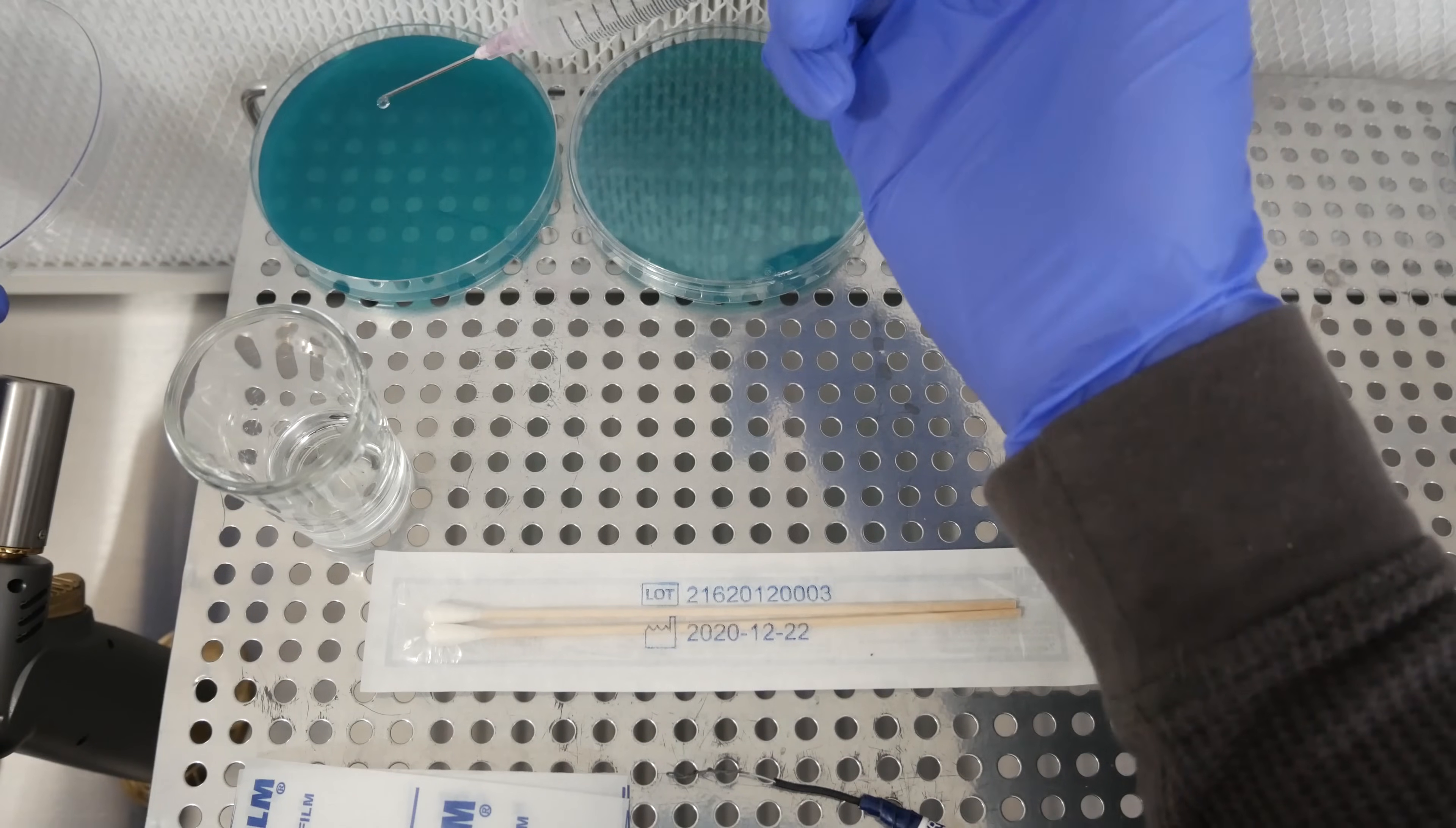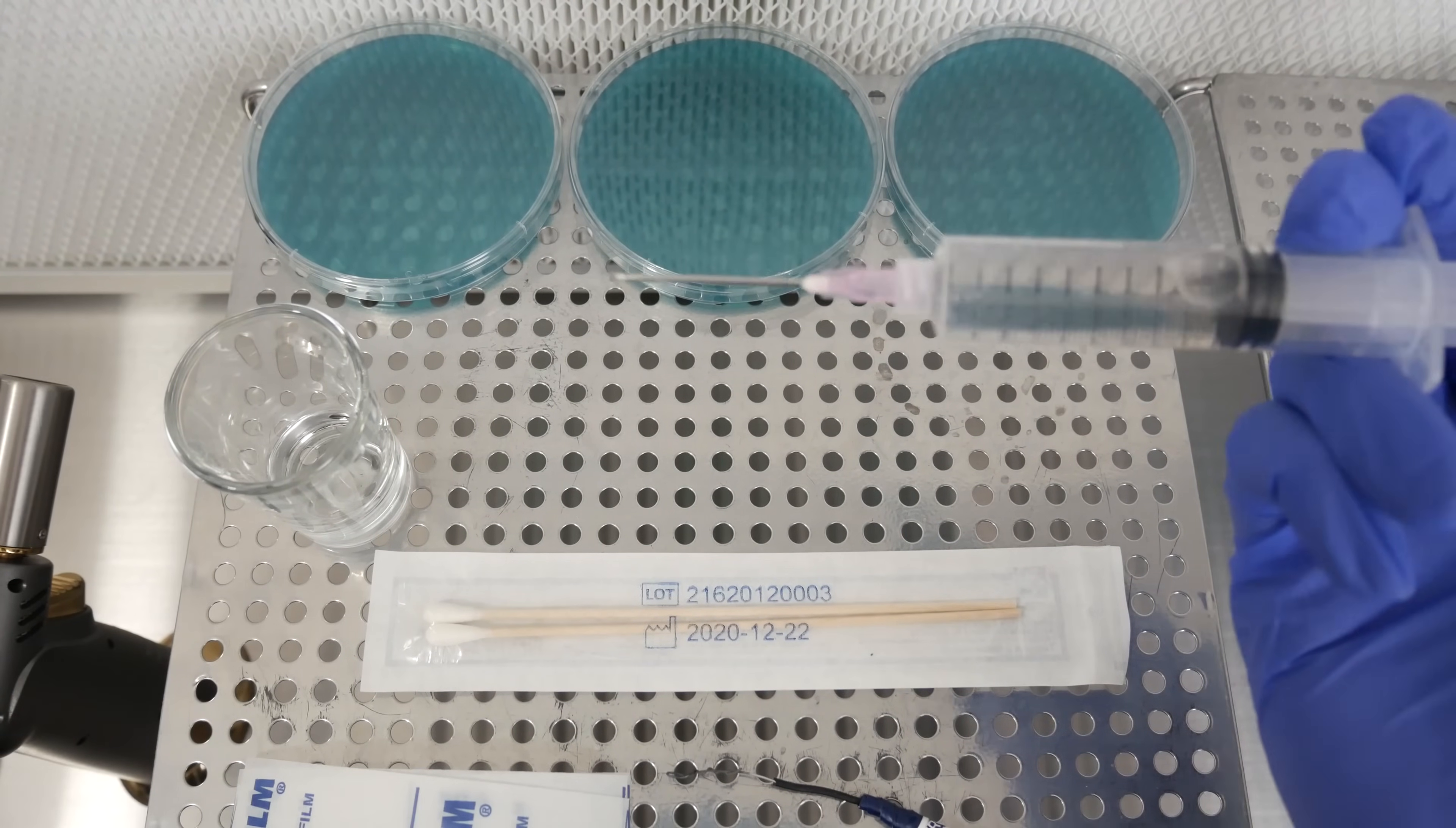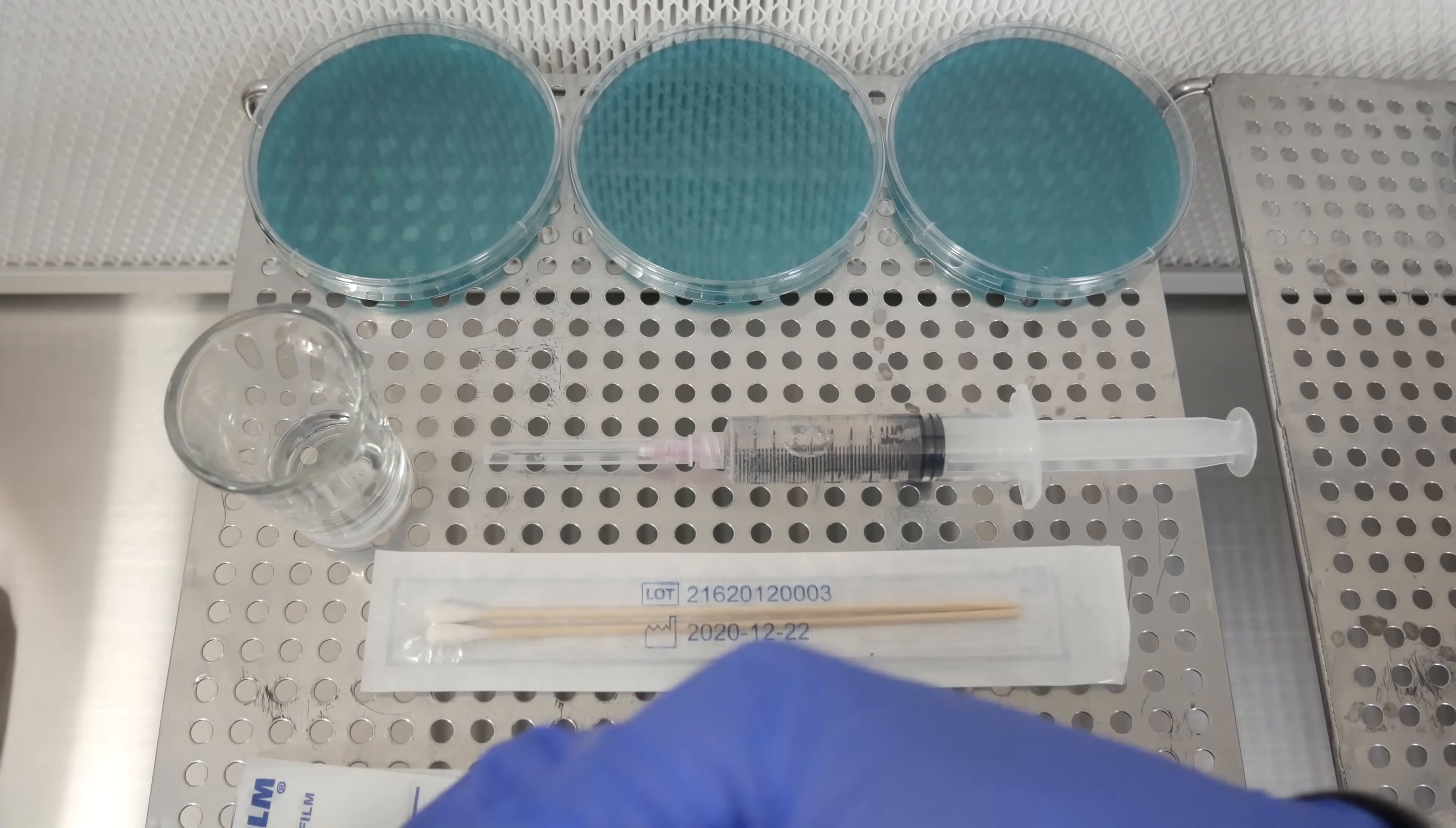For inoculating your agar dishes, you really only want one or two drops of your spore solution on the agar, that's enough, that's all you need. In my experience, I find that if you haven't used the spore syringe yet, the first plunge ends up squirting a lot more liquid than you really need. So squirting it out onto something else will give you easier control to squirt one or two drops onto your plate.